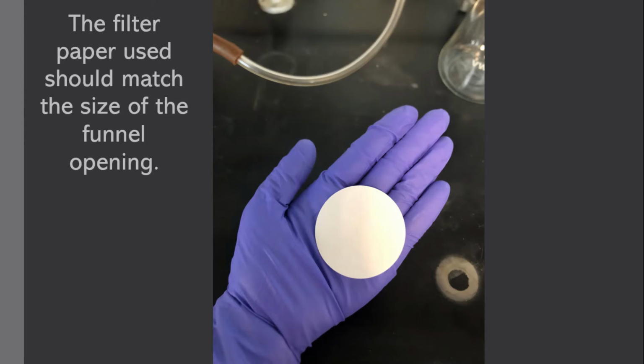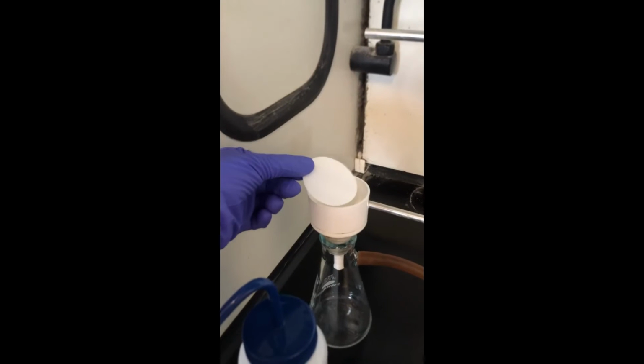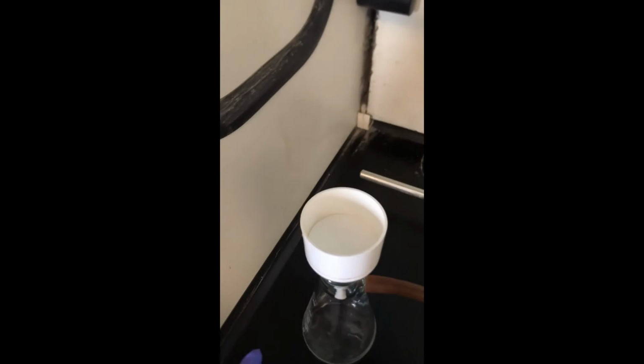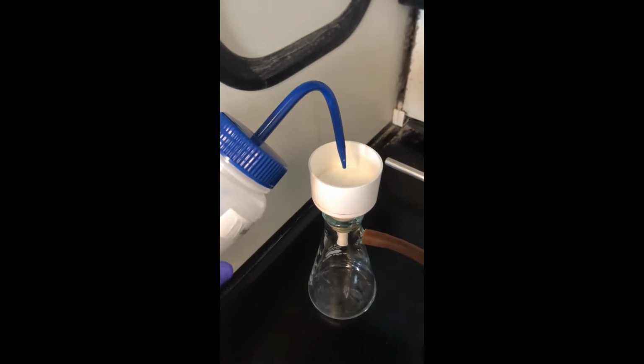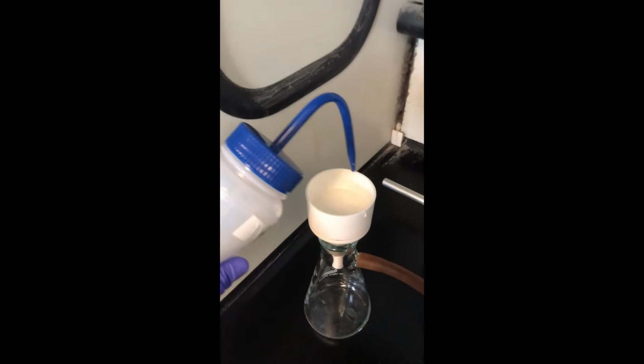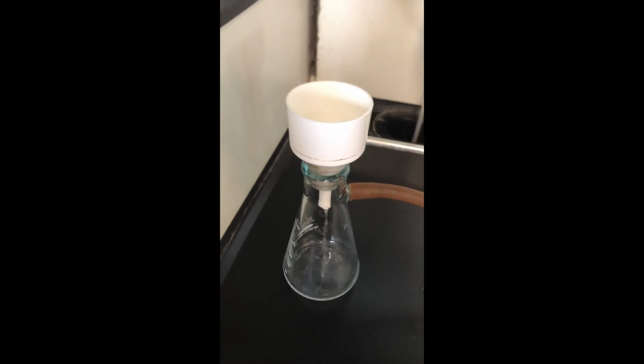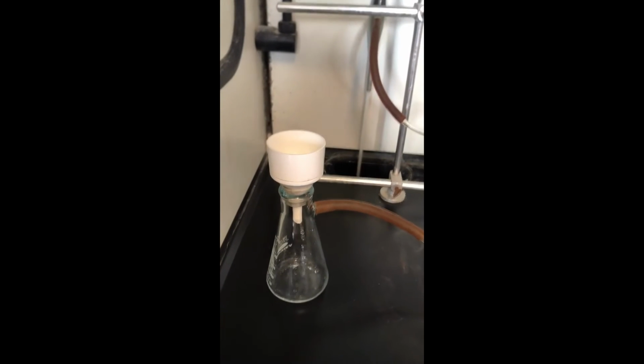And next I am picking the filter paper that will match the size of my funnel opening in my Buchner funnel and making sure that I seat that paper with water before I start my filtration process. This is an essential step. If you miss this, your product can get underneath the filter paper, as it'll curl up when you turn on the vacuum source if you have not properly seated it, making sure that it is wet and creating a vacuum seal with the funnel itself, getting ready for you to pour that product on top of it. And when you turn on the vacuum source, you should see the water you just used to seat the paper run out of the bottom of the funnel.